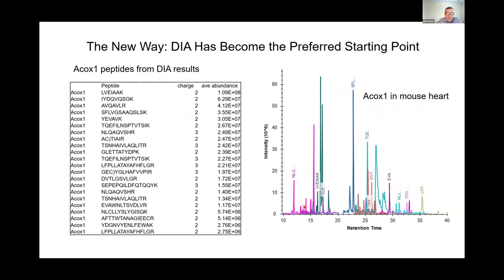So with all of these, I believe the trypsin does its job, so I believe there are equal amounts of all of these in our sample. And so the difference between this NLQ peptide and this SFL peptide is that it just responds better in the mass spectrometer. Mass spectrometrists are comfortable with this idea. There's a paper by a relatively prominent lab run by Ruedi Aebersold that talks about the fact that the response for the best flyers is essentially peptide independent.